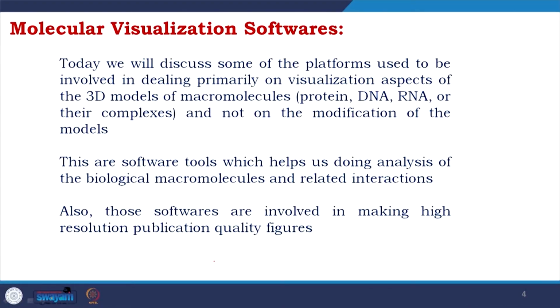These are software tools which help us do analysis of the biological macromolecules and related interactions. Also, those softwares are involved in making high resolution publication quality figures. So, you do your modification, you do your analysis and all, and then come to these platforms and produce high resolution figures which would be accepted for your publication.